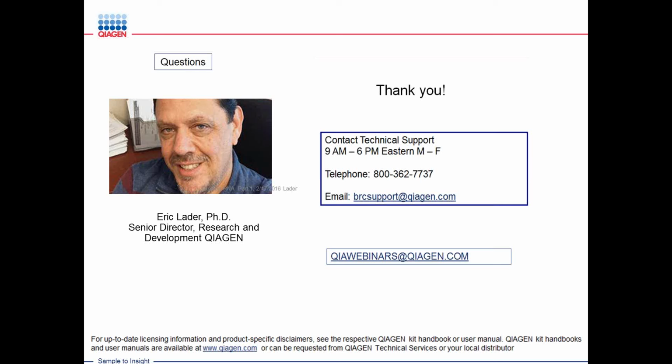The funny thing is, compared to PCR, in PCR you've got to split your sample to all of your assays, and in NGS you don't, right? But in NGS, one assay sucks up part of the read budget so that it's not available for your other assays. So if I had a rare target in with a bunch of abundant targets, the abundant targets would suck up more of the read budget.